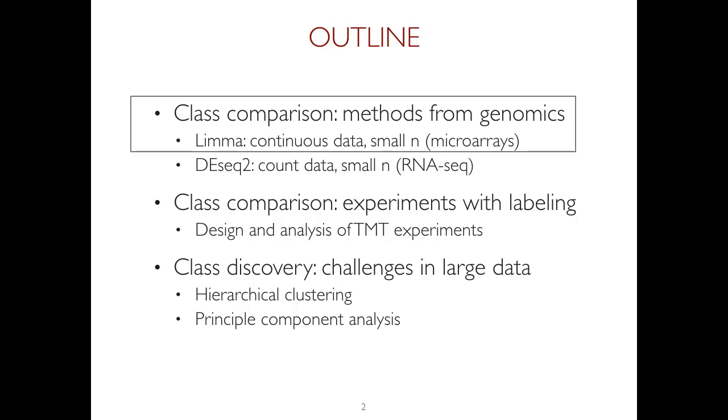And so what I would like to do is to comment on how that fits and what is appropriate and what is maybe not as appropriate, and how these existing methods can be leveraged in our context. So I have essentially a collection of different things which are used in various contexts, and we will see how far we get. This will include extensions such as the analysis of TMT experiments. So this is the plan.